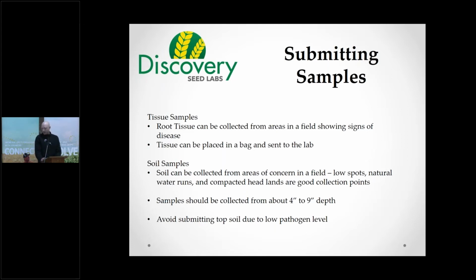Soil samples, you can collect them from any fields that you're interested in putting a pulse on, or say you've acquired some new land and you don't know the rotation history. You can do soil testing on there to determine whether Aphanomyces is present on that field.